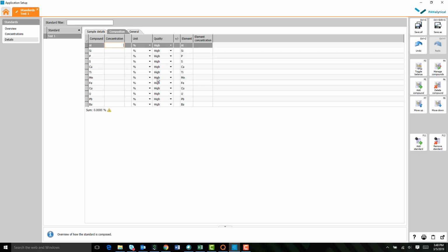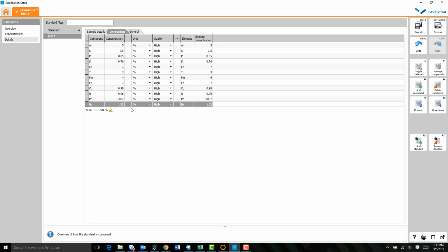So let's go here. I'm just going to put some random numbers in here, nothing specific. I don't have standards on me, so let's just make some things up, which is okay. Okay, so when I click off here, now the sum is going to be 31.677, and we get a warning sign.